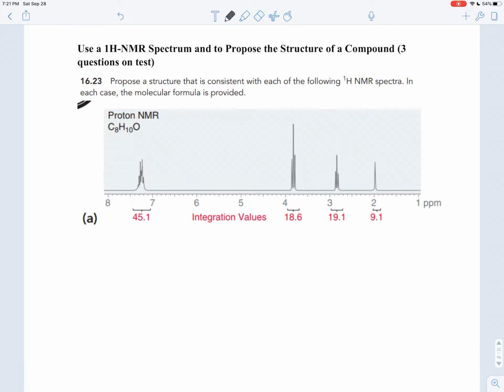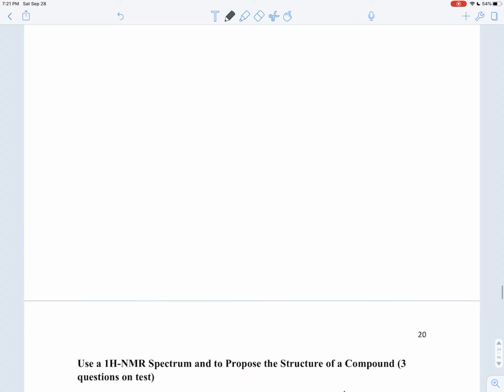So if you're given that, you can then go and do NMR, nuclear magnetic resonance spectroscopy, get a spectrum like this, and figure out how the atoms in that molecular formula fit together. And there are a few patterns that will really help you out if you know them. And so they are for these branches here.